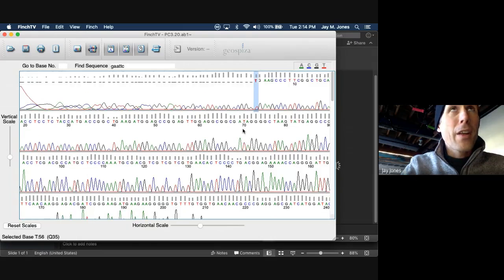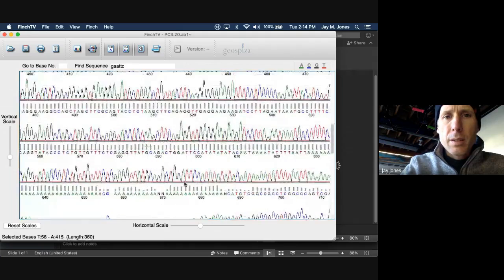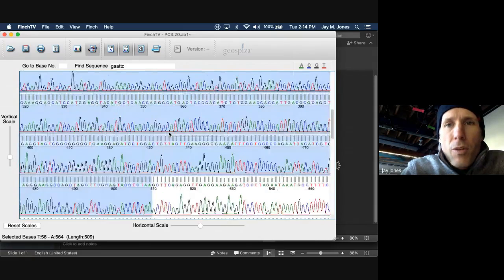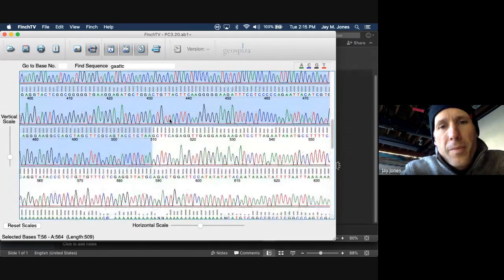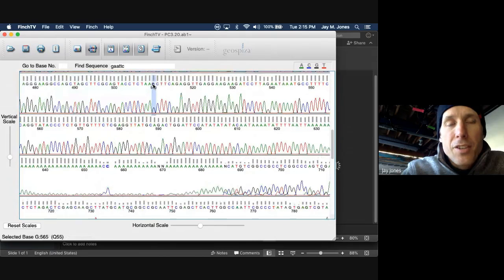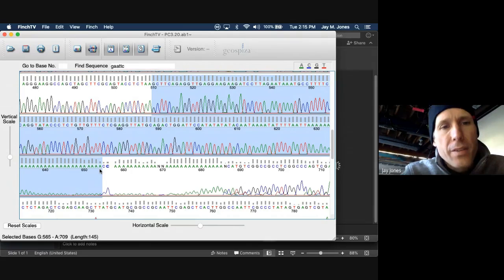And do you recall that our ORF is 1 to 509? Well, now I know my base is T1. Let's go look at 509, what that was. And it's right there. Look at that. So it's A509 all the way back to T1. T1 to A509. That's my ORF. And my 3' UTR is all the code after that. Here's my 3' UTR. G510. That's where we stopped initially, to A651, 2, 3, 4, A654.